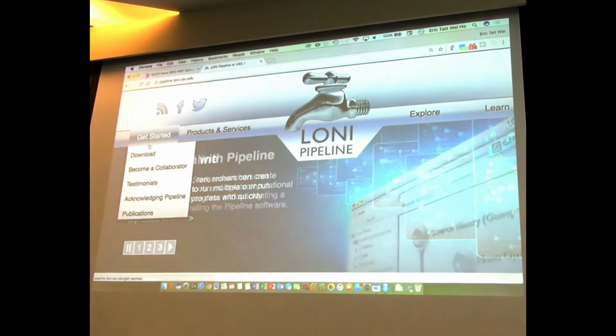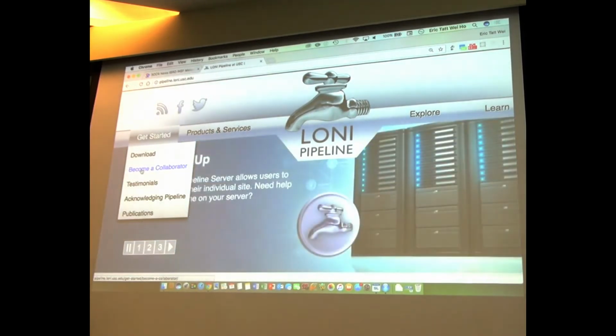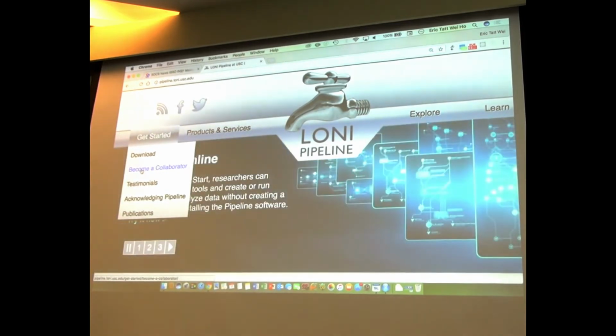So, if you want to use this environment, you can use it as a guest on the USC server without any special setup, and I'll show you. We'll try to use Eric's computer here to mock up something real quick.